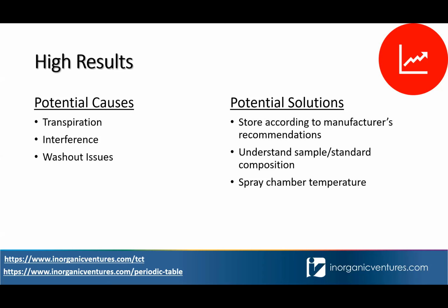And we also have washout issues associated with the age of our HF resistant spray chambers. So the spray chamber that we use has a coating on the inside, and depending on how much solution containing HF we're analyzing at one time, we can see a degradation of this surfacing, and we need to send that out to get it resurfaced periodically. And again, the resurfacing just depends on the nature of your analysis, how many samples and the type of sample that you're analyzing.